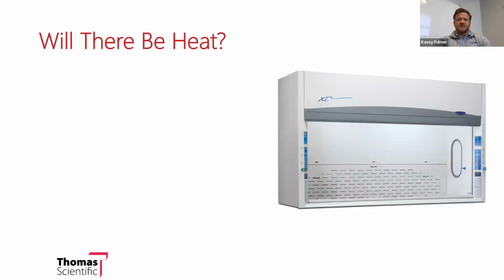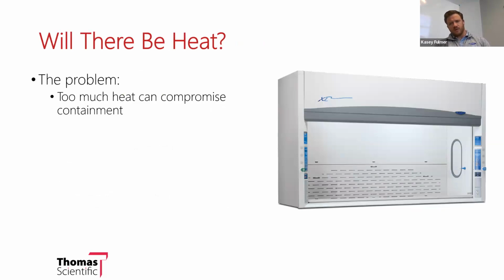The other thing to consider is, will there be heat in your application? I know that this is actually a very common thing, as oftentimes people are heating things in their chemistry and in their science. And generally, heat can be mitigated pretty easily, but occasionally there can be a problem where there is too much heat in a fume hood.